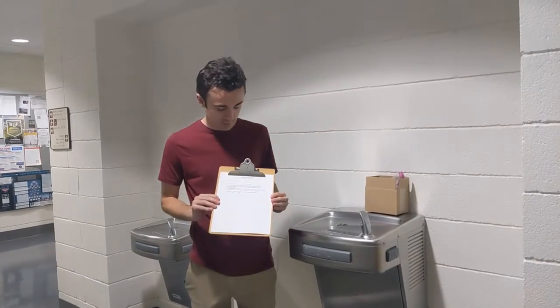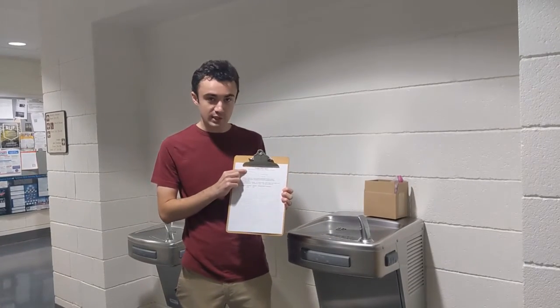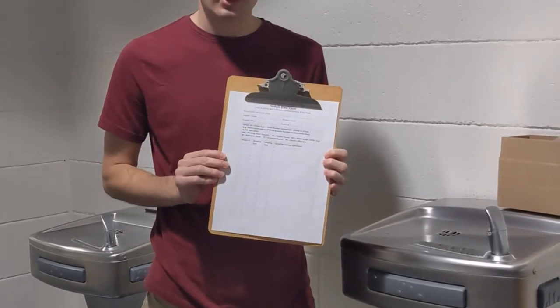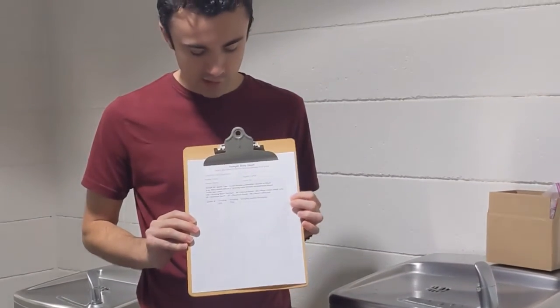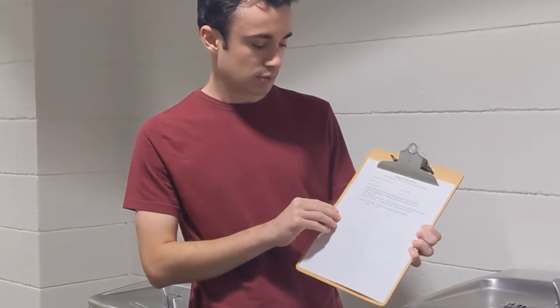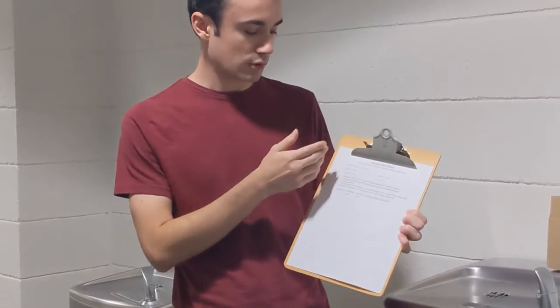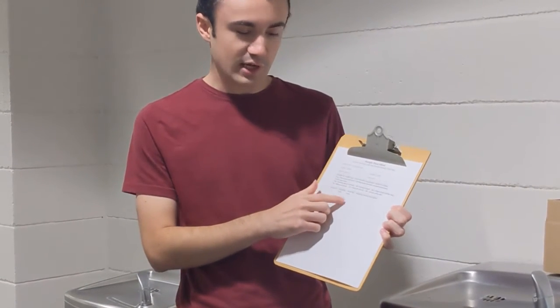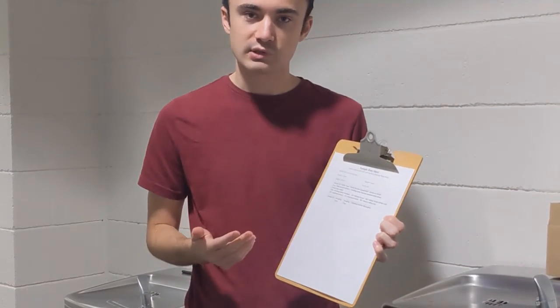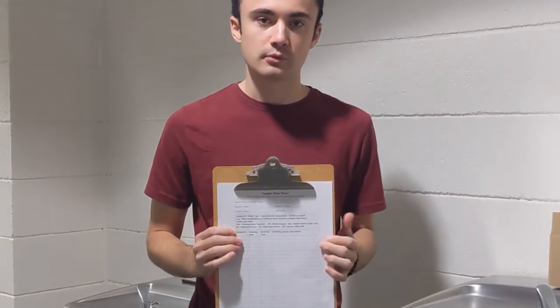Now you can fill out the sample data sheet. You'll need to list the facility name as well as your facility ID that you've been assigned, and the sampler should list their contact information as well. Then for each sample, you will list the sample ID, which we determined before, and the sampling date and time, and then a brief description of where that sample was taken. And again, on the other sheet, you can find an example.